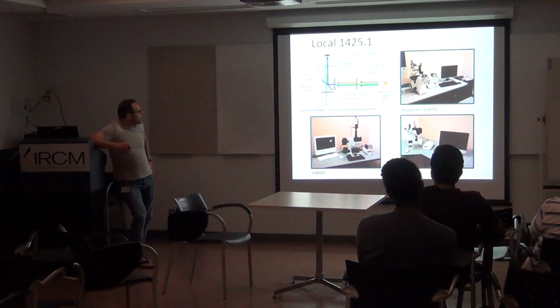Another room where you do have just a regular fluorescent microscope. This one is inverted, this one upright.